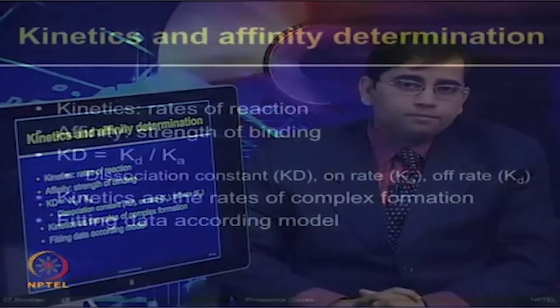The left panel graph is showing the raw image generated, the y axis is showing the response unit, RU, and the x axis is showing the time scale in seconds. Now, the y axis transformation shows that all the spots, which were showing sensorgrams from different levels, are now at the same baseline. By using SPR and SPR imaging, the kinetics and affinity can be determined.